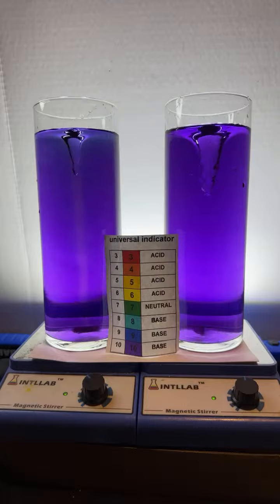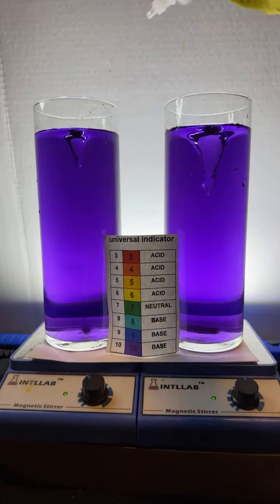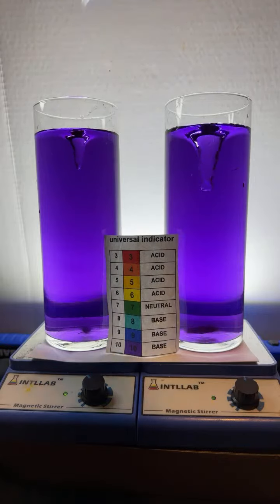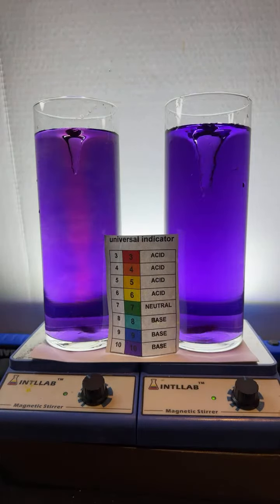Now we're going to add some hydrochloric acid. This is the same acid that's in your stomach. It's just like 100 times more concentrated. Like one drop of this stuff has more acid than's in your stomach. So here we go. I'm just going to add one drop over here on the left. You see that red color grow in? That's telling you there's some acid that's been added.